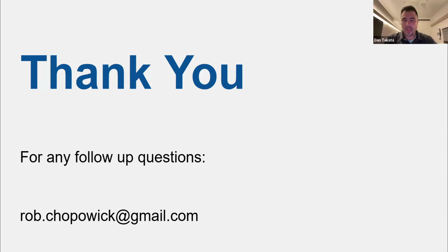Yep. Hey, Rob. Yeah, thank you. Looks like we do have a few questions coming through. Let's see. I see some coming in. We've got the Q&A. We've got a couple in the chat. Ductless fume hoods. Do you have anything on ductless fume hoods that ASHRAE doesn't cover?